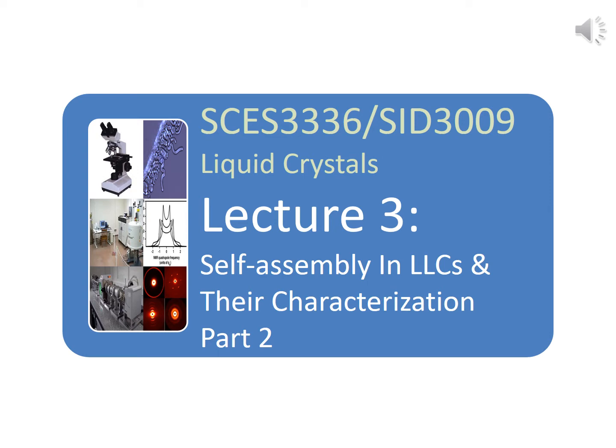Today, we continue with other methods that can be used to identify lyotropic liquid crystal phase. In my previous lecture, I explained that there are two methods in determining the phase of lyotropic liquid crystals by optical polarizing microscopy. The first method is called contact penetration study, in which we can find out what lyotropic phase exists, but this method cannot find out the actual composition of the solvent or mesogen.